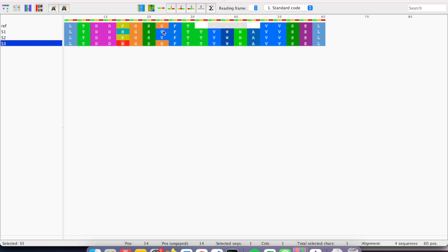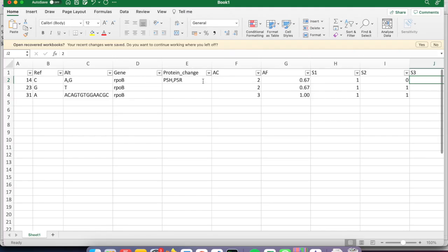This is a glycine to valine. Position 1, 2, 3, 4, 5, 6, 7, 8. Glycine to valine. Obviously here it's a bit more tricky. Let's just ignore this for now. So maybe we can denote a special character for any information which we don't want to record. So let's just make that a dot.